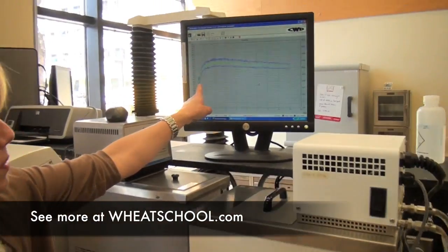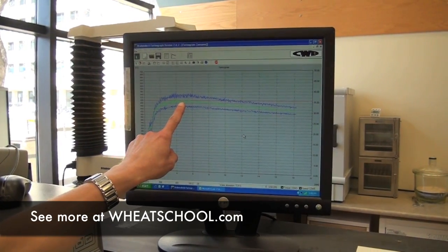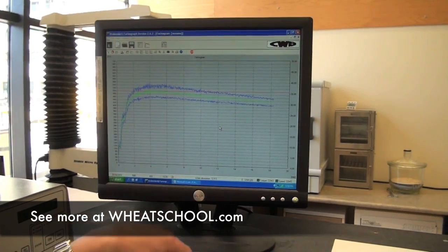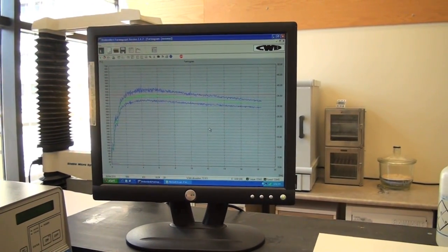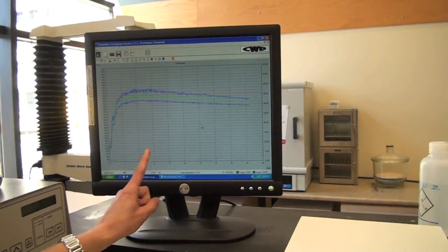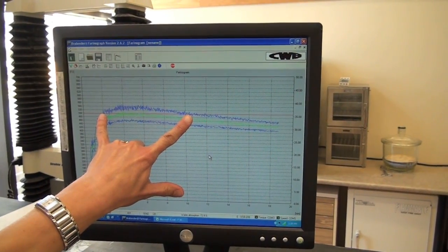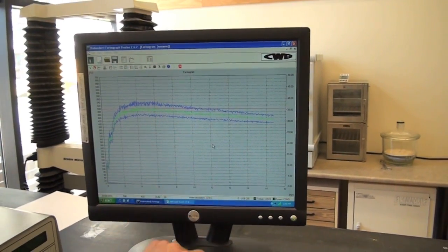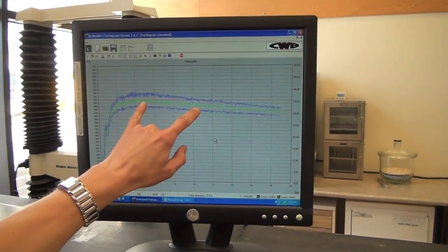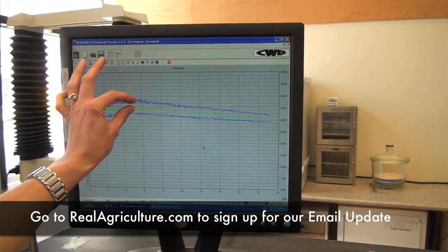You can see here that as the water is being added, our dough rheology or viscosity or torque is increasing until it reaches a maximum point, which is the development time of that particular sample. As it continues to be mixed, this line starts to decrease, which means the dough is breaking down and losing its viscosity, exerting less torque on the mixing blades. We measure the development time, the stability — which is the amount of time in minutes that the top of the curve is above the red line — and also the mixing tolerance index, which is the drop in the curve from its development time to five minutes after that point, measured in Brabender units.